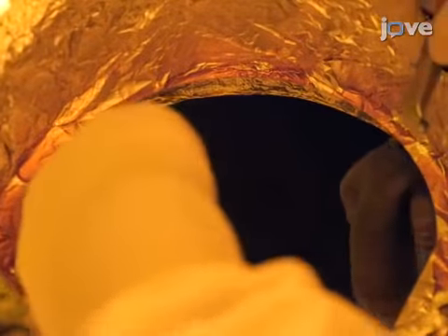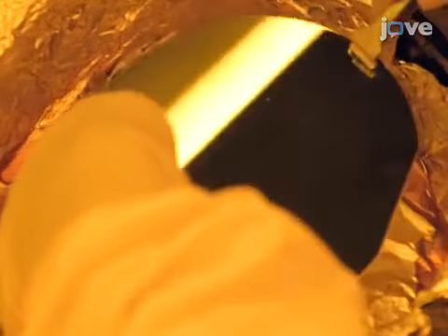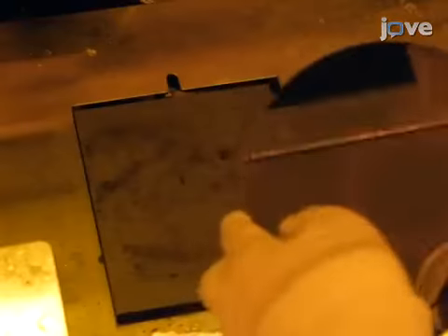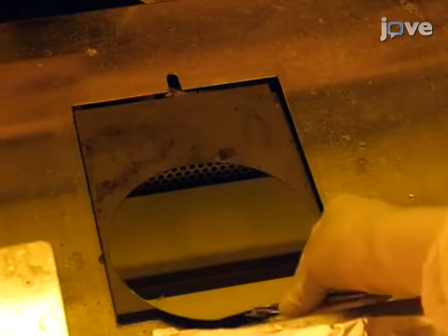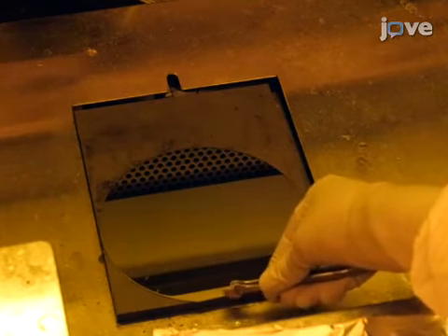When finished, release the vacuum on the chuck and use wafer tweezers to retrieve the wafer. Next, place the wafer onto a hot plate and soft bake for the amount of time specified by the photoresist supplier.